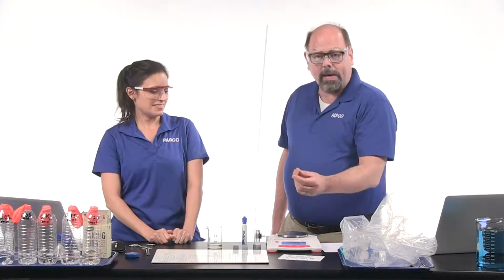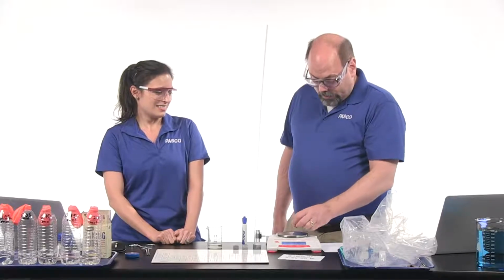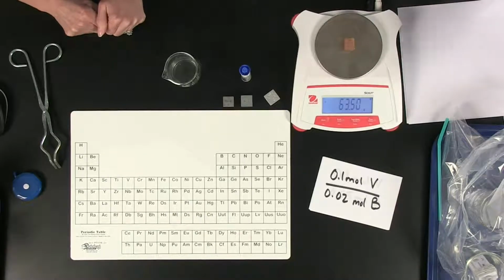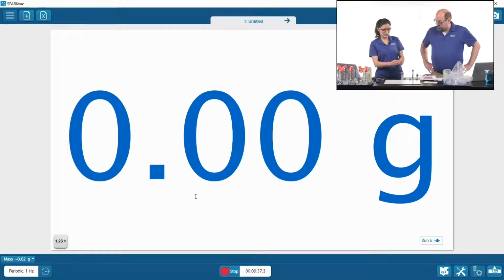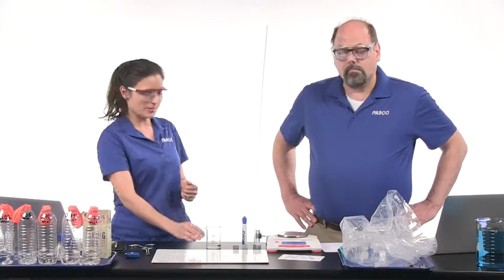This, you can tell, looks like a penny. So it's made of copper. If I put it on the scale, and if we look in the periodic table, we should get around 63.5, exactly where we're at. Maybe a little less. Or that looks really good. And it's the same as that atomic mass. And so these are just convenient sizes for chemists to work with. Yeah, it's easy to visualize a mole too, of how small atoms are when I look at these. This is our mole set, and you can get this at PASCO.com.